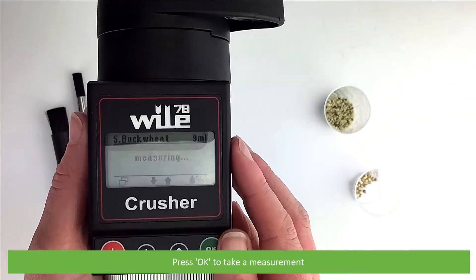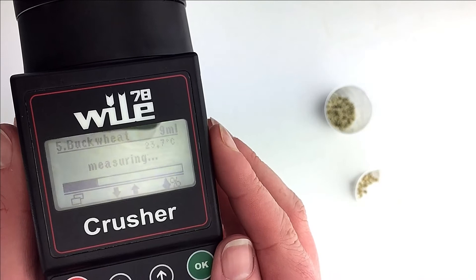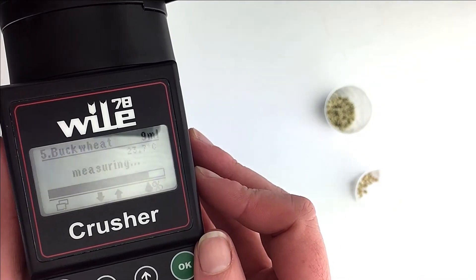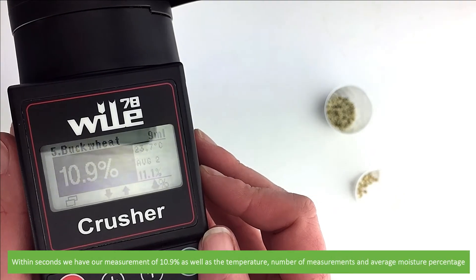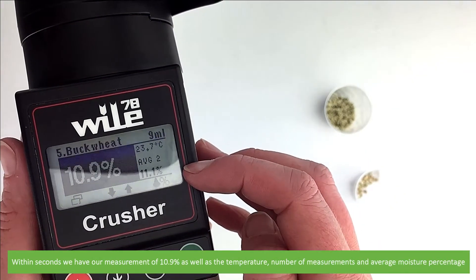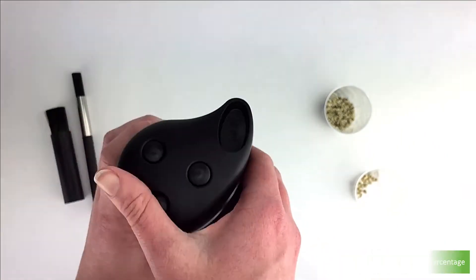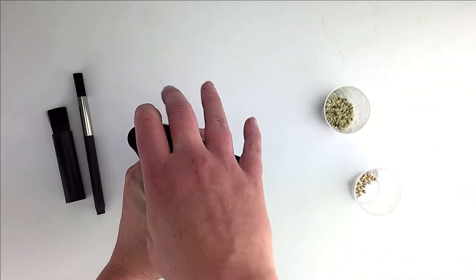Press OK to take a measurement. Within seconds, we have a measurement of 10.9% as well as the temperature, number of measurements, and average moisture percentage. Measurement is complete.